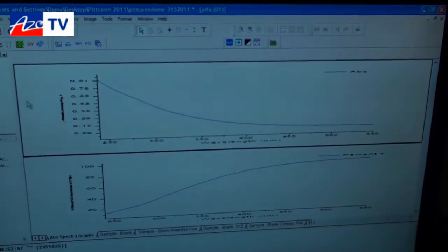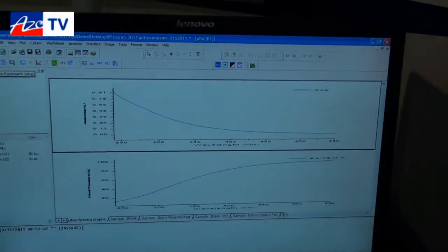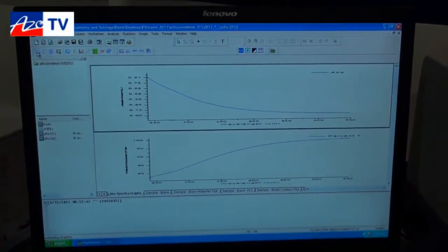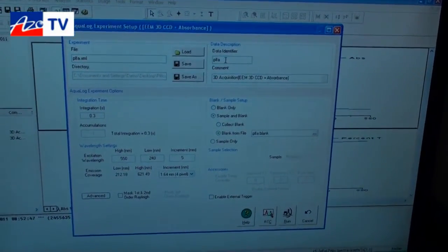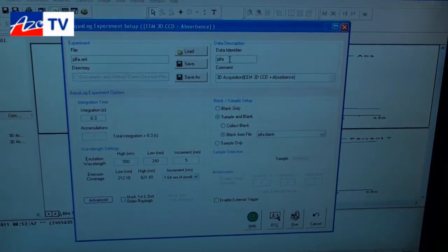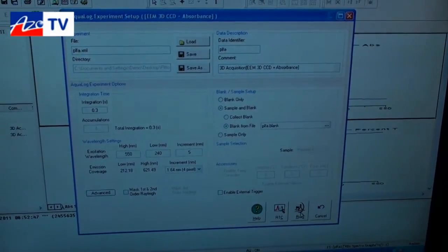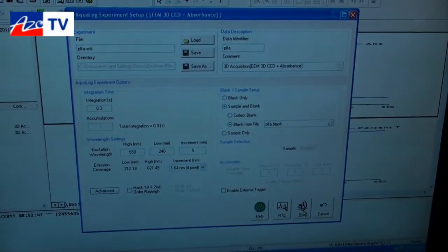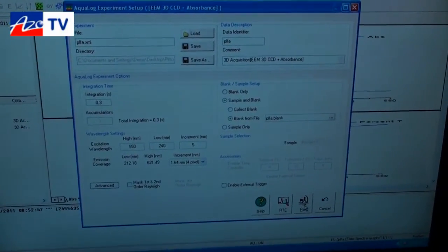As you can imagine, the data collects roughly a hundred times faster than anything that's on the current market today, so I'll give you a brief demonstration of a collection of a sample. This sample is actually a standard sample from the International Humic Substance Society, it's known as the Pony Lake Fulvic Acid Sample. Many water quality researchers use this sample as a target to validate their multivariate analysis of the excitation emission maps once they've been corrected.